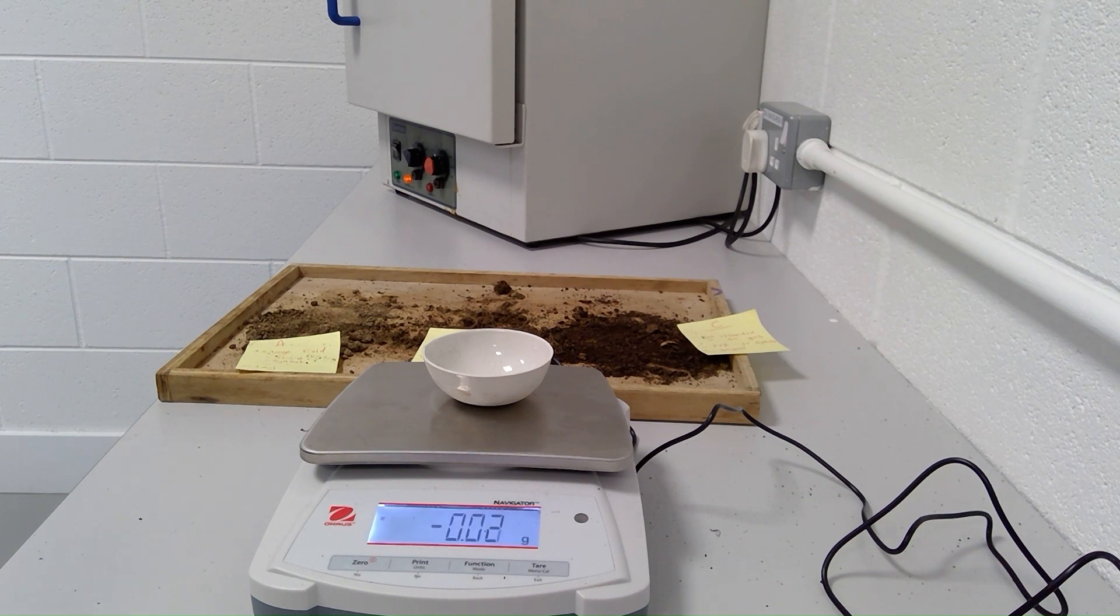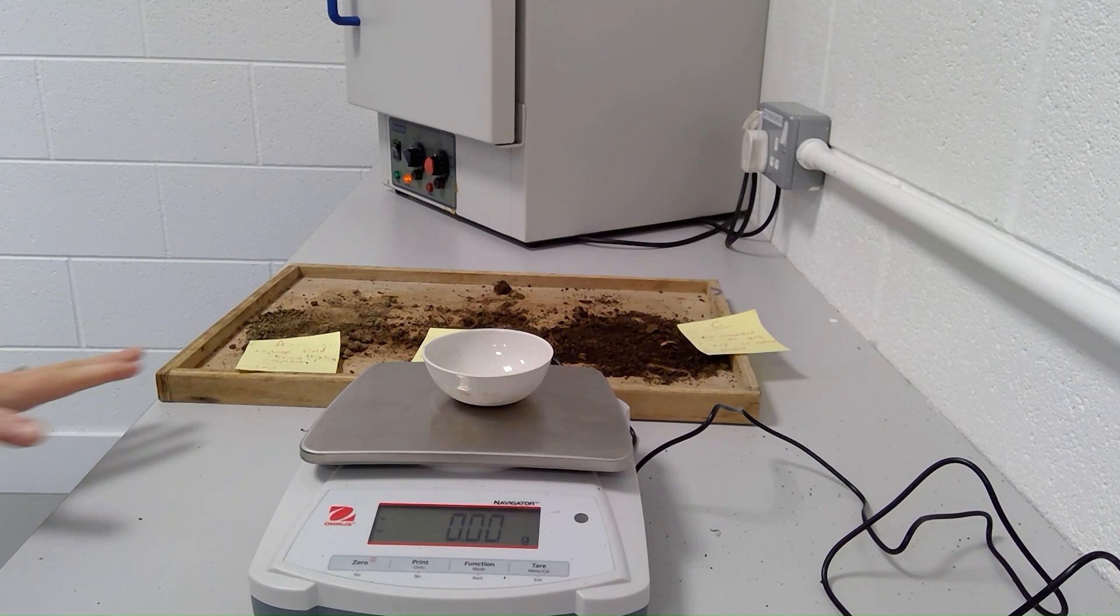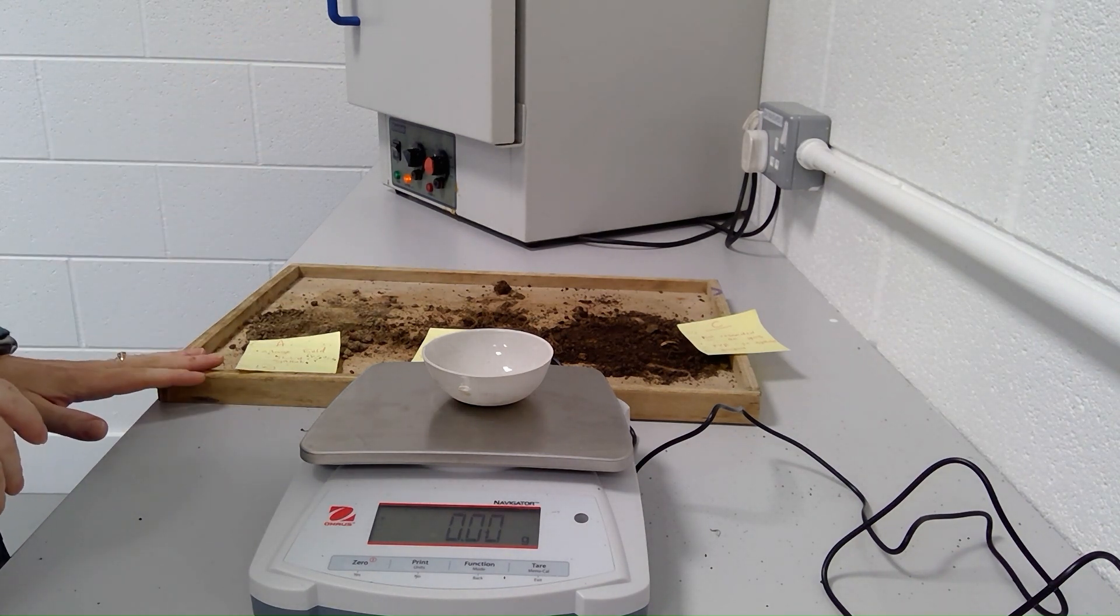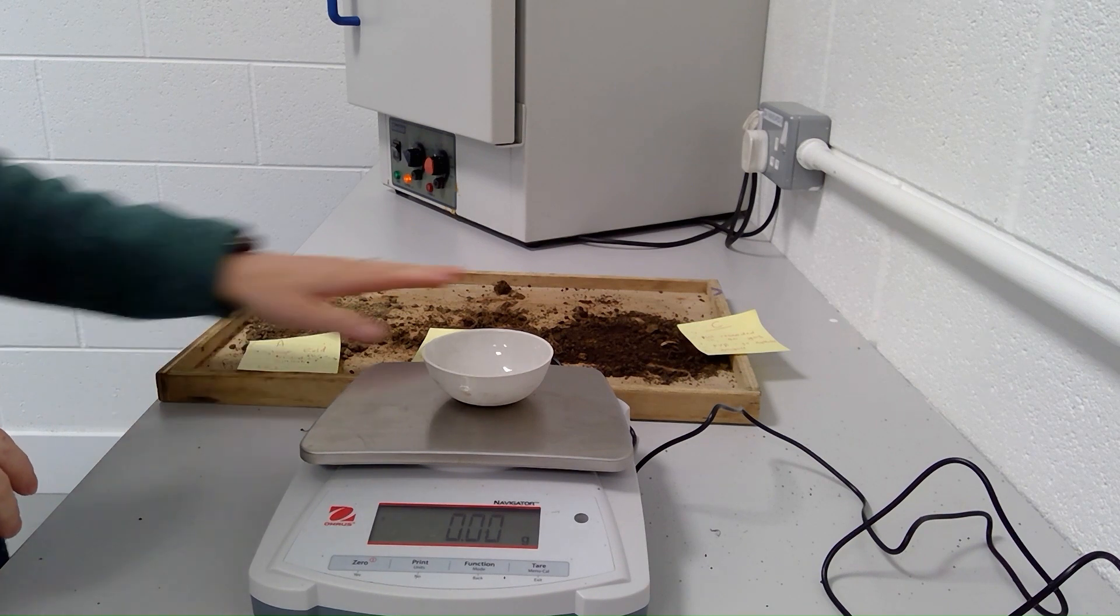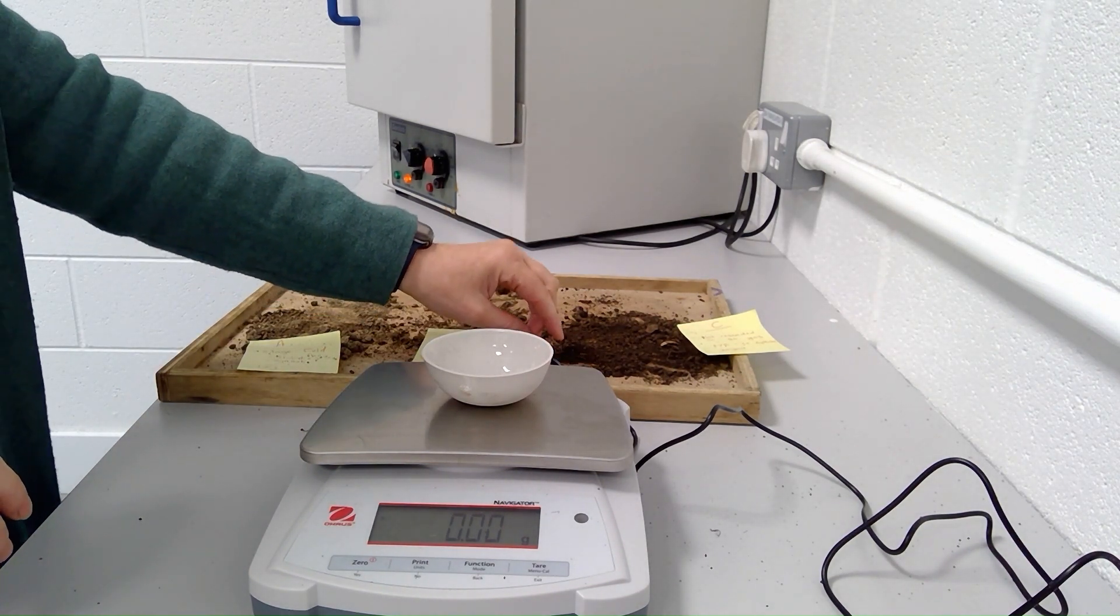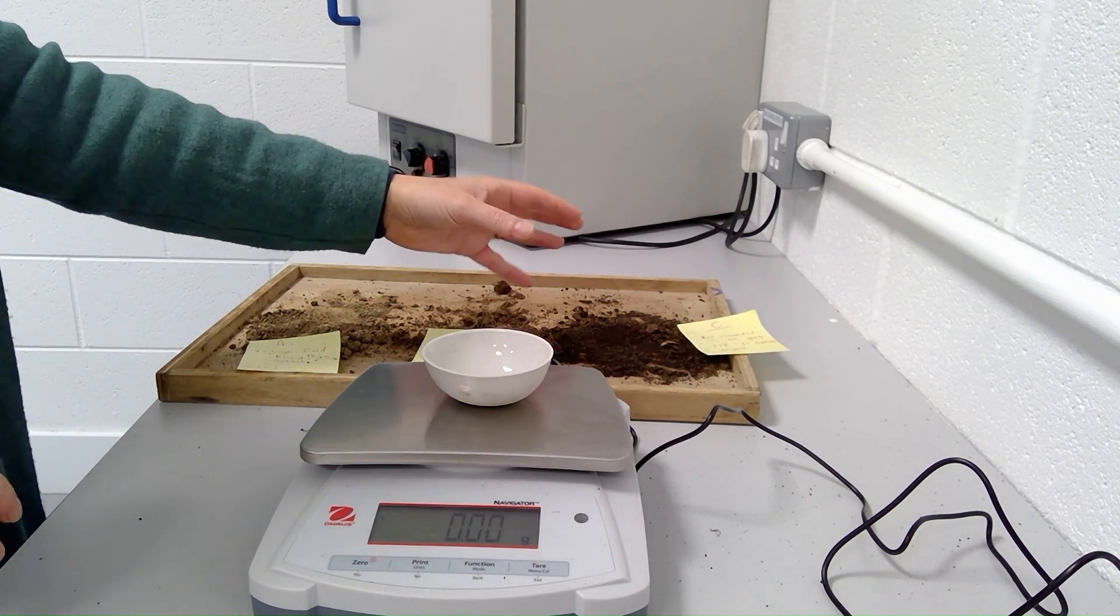Once the mass remains constant, then I know the sample has dried out and is ready to use in the next step. An interesting note is I could calculate the percentage water content of the soil sample, and I would expect it to be higher in the soil that is darker because I think that soil has a higher organic matter content.